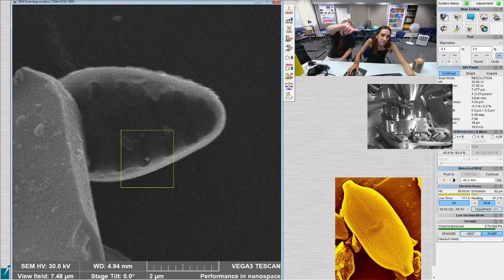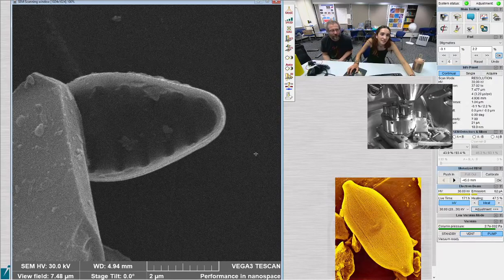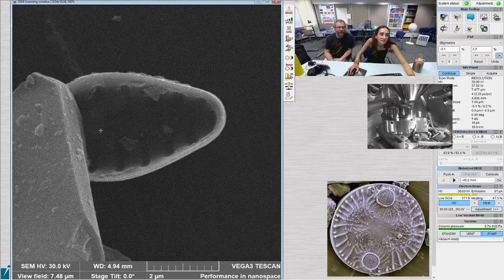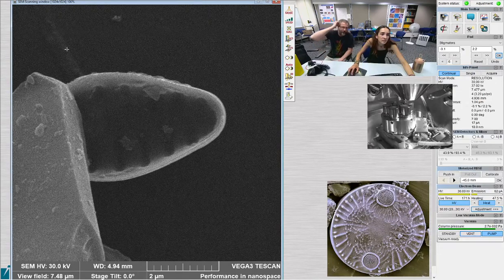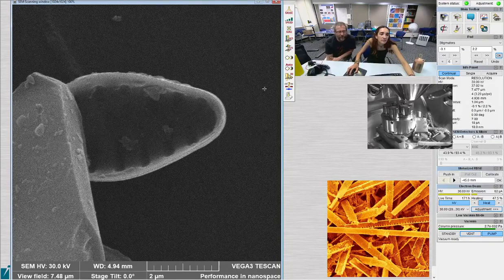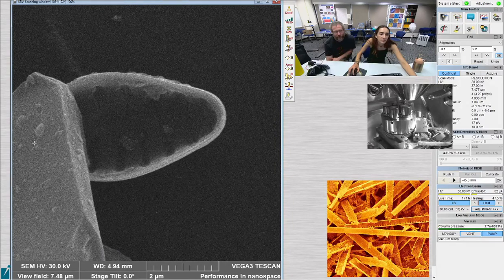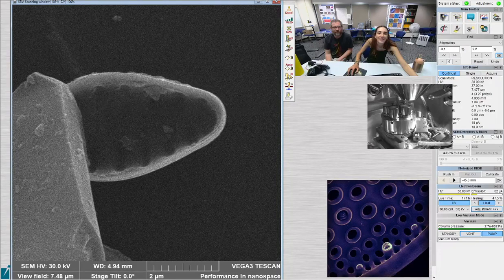You see how it's got lines at the top? Okay, just want to make sure they weren't going to stay that way. Yeah, it's just a little bit of a distortion from the edge right there. I think the volcanic ash edge is what was causing the defect. But I think that's just a typical Stauroneis. I'm taking a picture. Okay. Can you focus on the areolae?